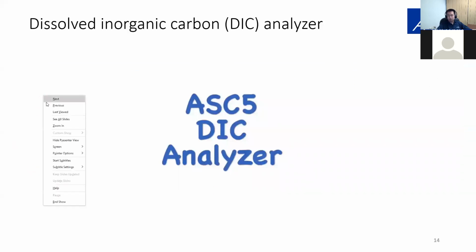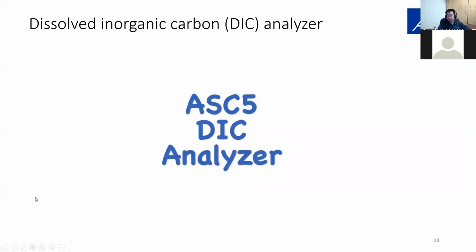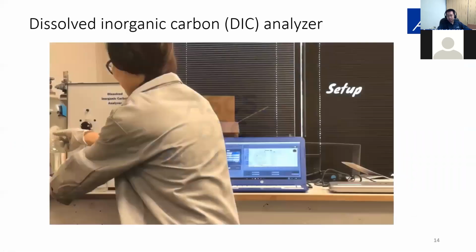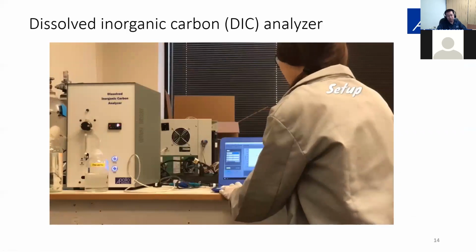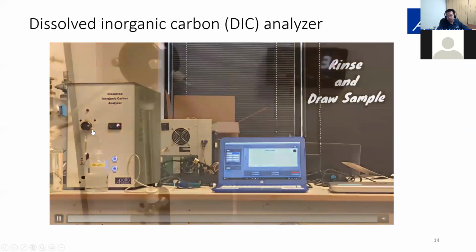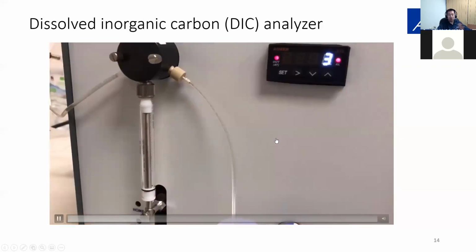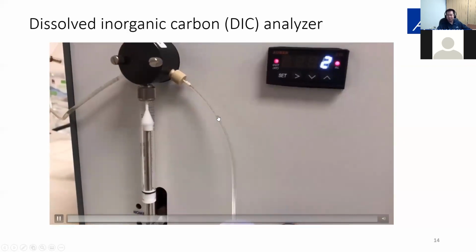Here, I want to show you a video of the operation of the system. In the video, we have a single sampler. Again, all the standard and sample have to go through the same port. But the whole process is still automated. You just have to come in and change the sample.